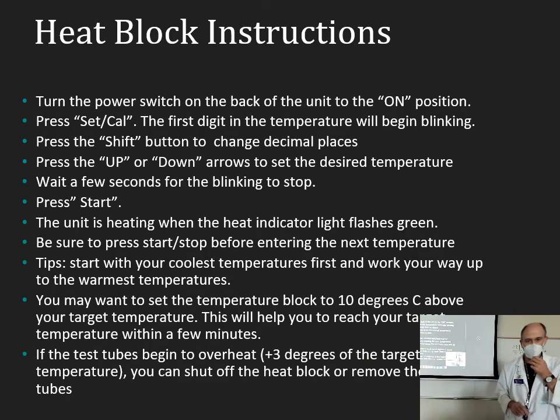Okay, now the heat blocks. I have a video on how to run the heat blocks, in case you want to look it up on your phone or something while you're doing this. The heat blocks are a little unintuitive, but first things first, and TAs, I added this to the bullet list on the one online.